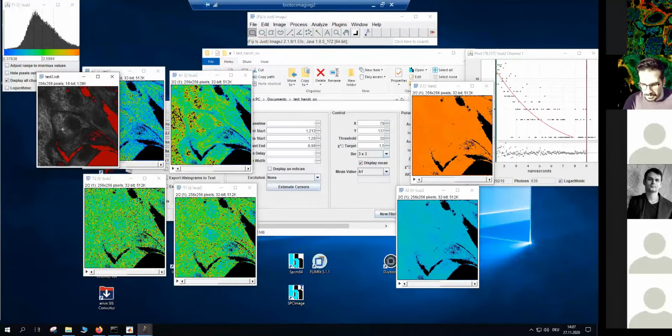Yeah, so Marcos, we keep this question, and we can also ask the developers that are working on both cases, and also the Leica people. Since they're also developing LAS X phasor, they might have a more satisfying and accurate answer. Martin Spital said the binning is like a rolling average, actually a rolling sum, for example a 3x3 mask. Yes, that's true.